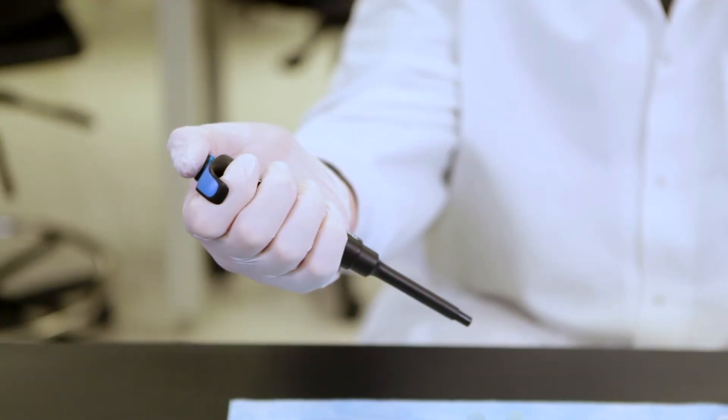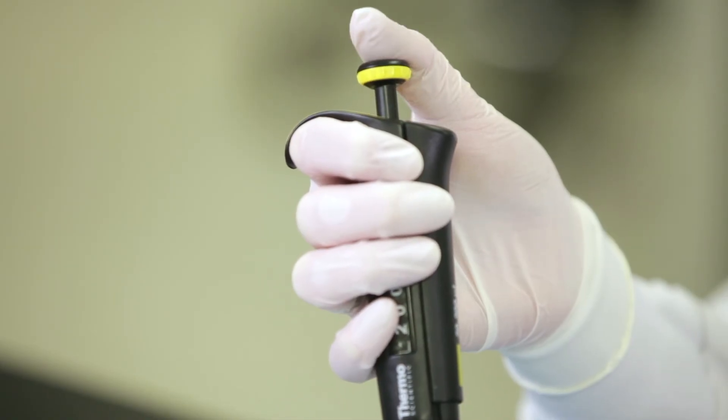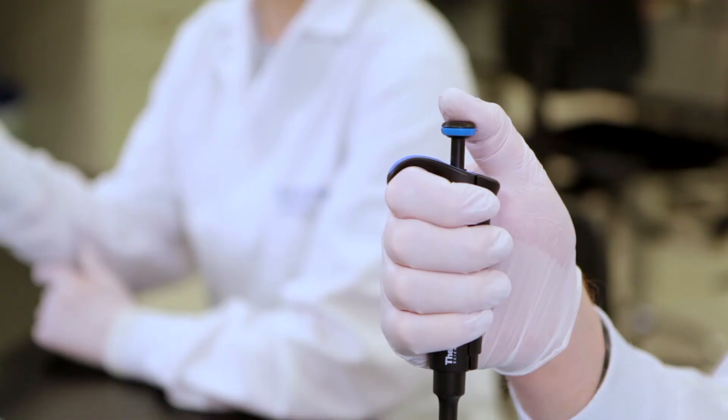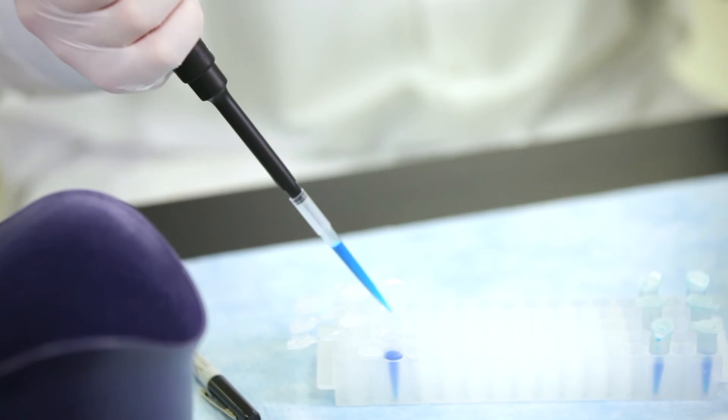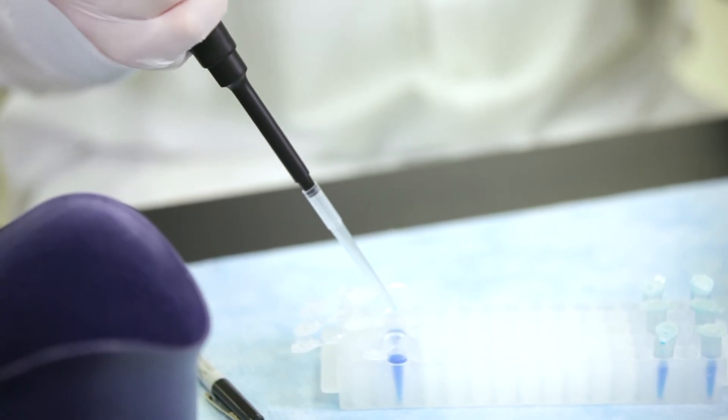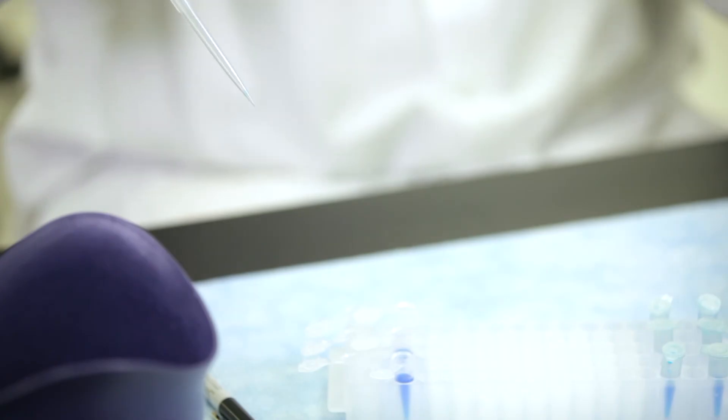To use the pipette, depress the push button until you feel some resistance. This is the first stop. Place the pipette into the liquid and slowly release the button. To release the liquid from the pipette, push past the first stop to fully expel the liquid from the pipette tip into the recipient container. Before you release the push button, withdraw the pipette from the container.